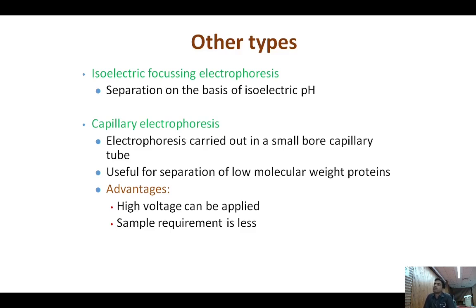What we saw was agarose gel electrophoresis for serum protein, right? So other types are isoelectric focusing electrophoresis. Here the separation will be based on isoelectric pH, not on the charge or size and shape.